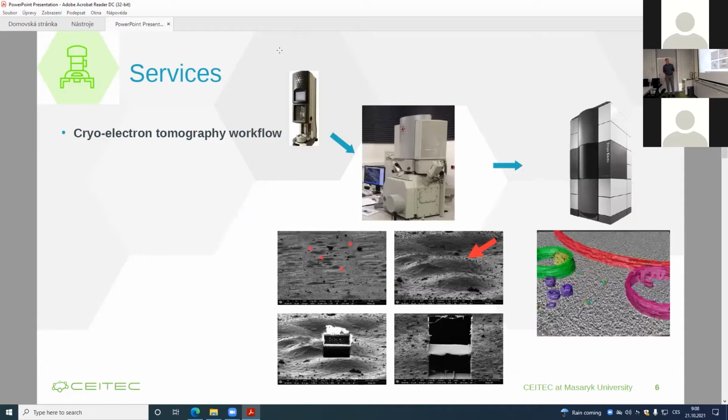All right, the other workflow that has been established here since the very beginning is the cryo-electron tomography workflow that is based either on plunge freezing of the sample and then directly collecting cryo-electron tomography data, or, in a more complicated way, you transfer your sample into this cryo-FIB-SEM instrument in order to observe the cellular samples and use the cryo-FIB to cut or mill a thin lamella from your cell for the in situ structural biology studies, and then go back to the cryo-TEM for cryo-electron tomography.